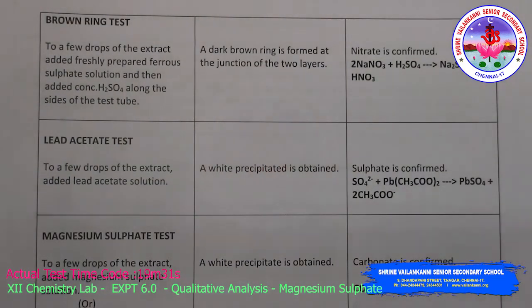Brown ring test. Take the extract and add freshly prepared ferrous sulfate solution and add concentrated sulfuric acid along the side of the test tube. A very important thing: only freshly prepared ferrous sulfate solution is added. If you use an old solution, it has already converted to ferric. That's why we have to use only freshly prepared ferrous sulfate solution. A dark brown ring is formed at the junction of the two layers, which indicates nitrate is confirmed.